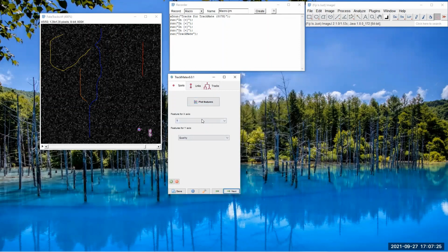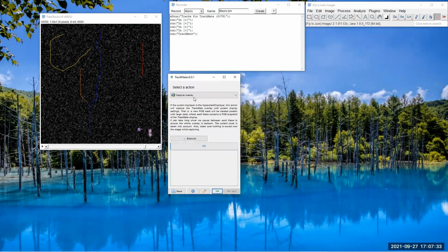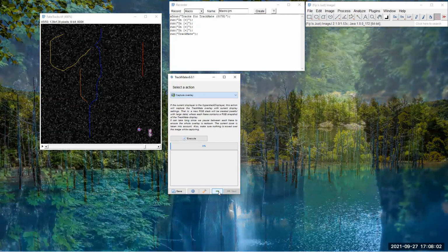Finally, you can plot some of the charts here, but I usually don't do that. I usually go all the way to the end and export it out. I think I can export it as an XML file, or I thought there was a CSV file, but I might be wrong somewhere. So I can export it and open it up in Excel to do things. That's my understanding of this plugin. Of course, I skip quite a lot of stuff.